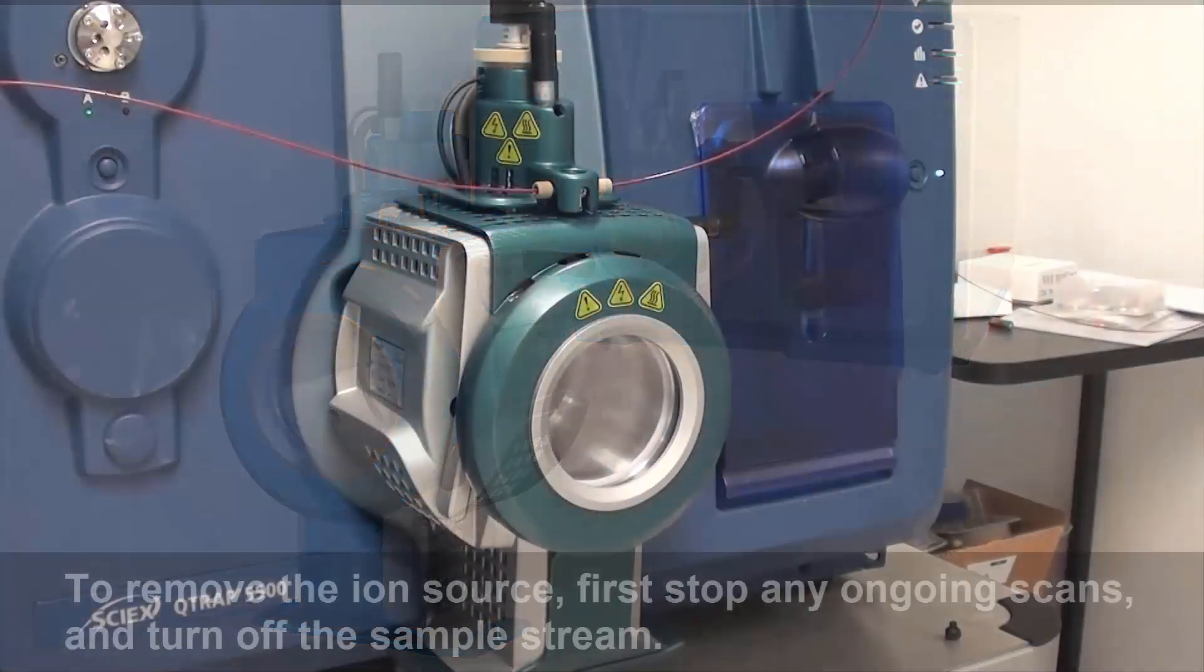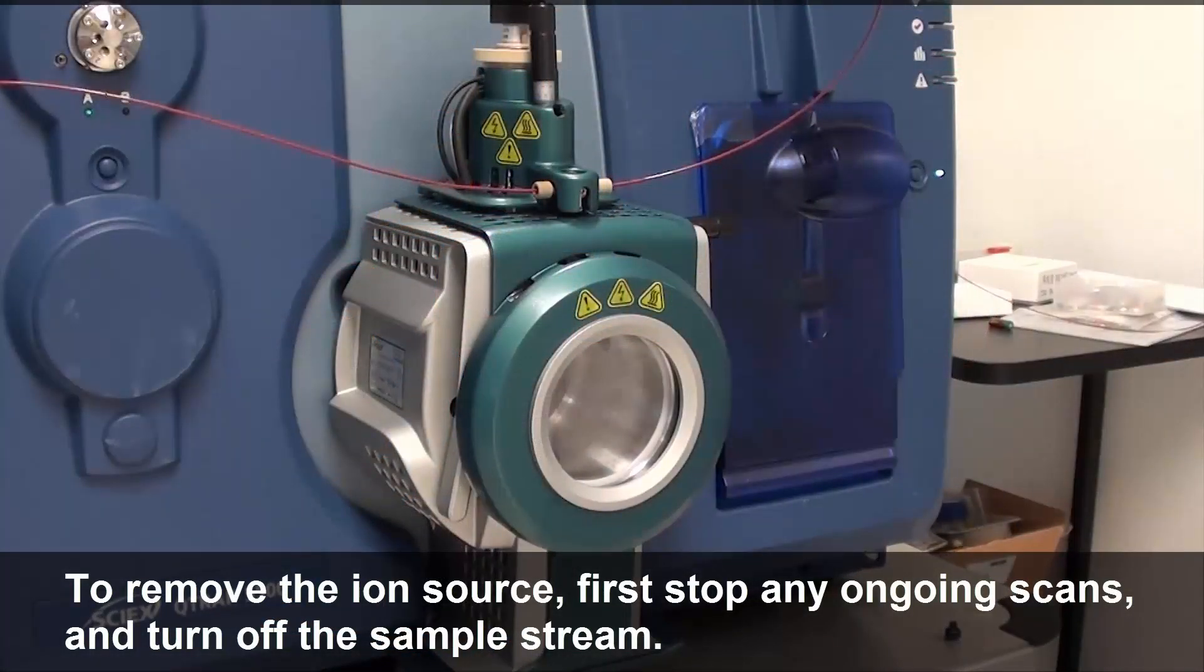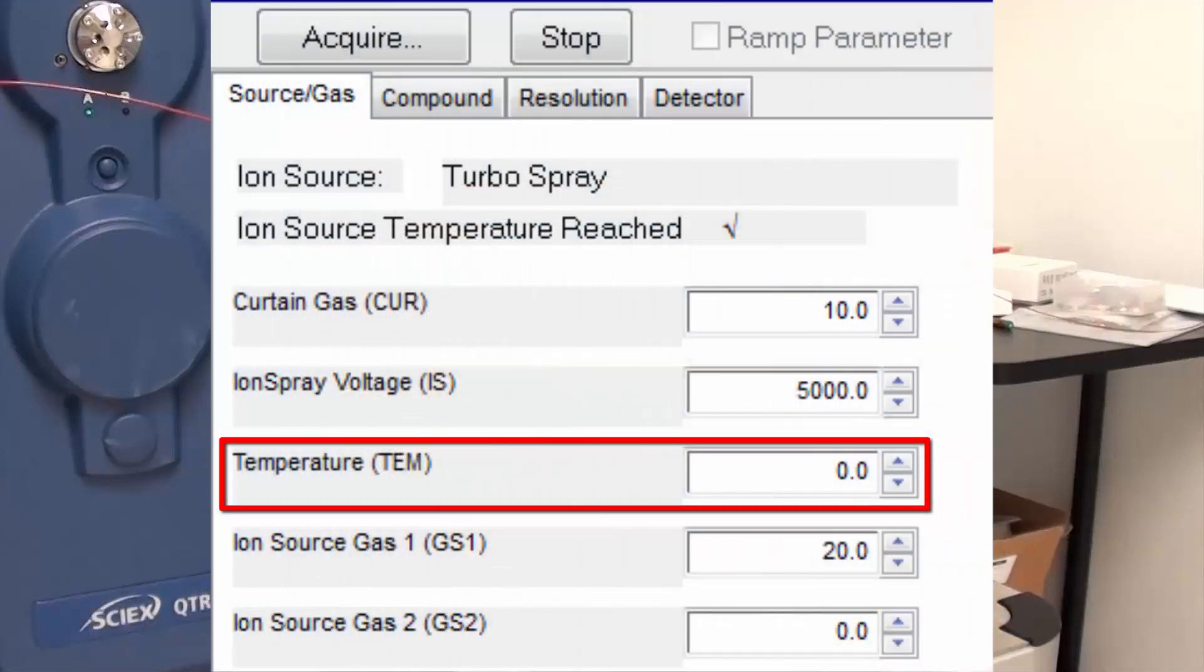To remove the ion source, first stop any ongoing scans and turn off the sample stream. Type 0 in the temperature field if the heaters are in use.